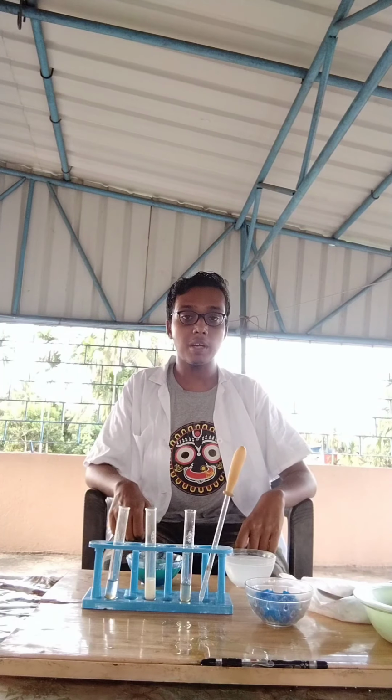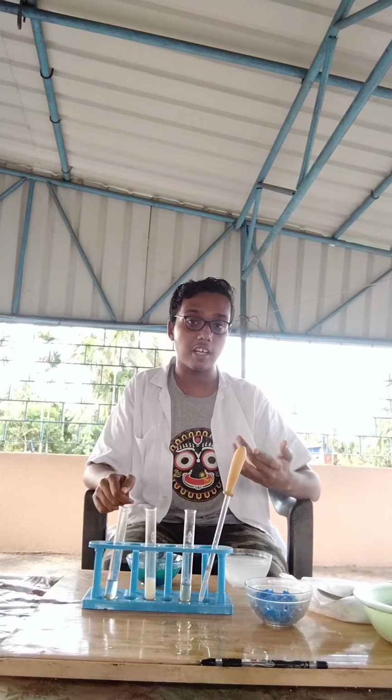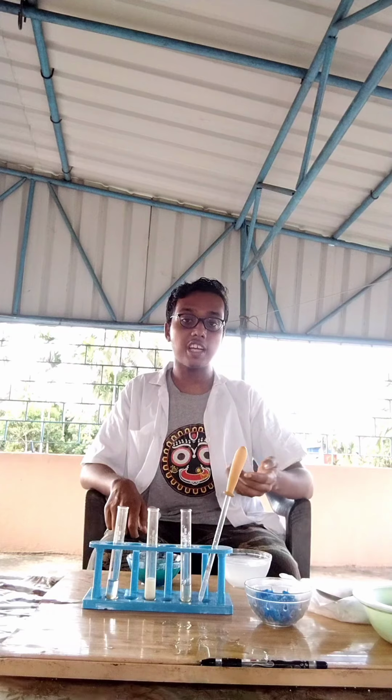The main principle behind our experiment, the BIURET test, is that the alkaline copper sulphate solution, formed by mixing copper sulphate with sodium hydroxide, will react with any peptide group present in any food sample to give a characteristic violet color. The more protein or peptide present, the more violet color will be formed after the experiment. We will see the color change in the experiment.